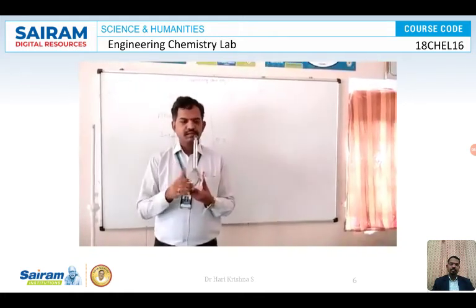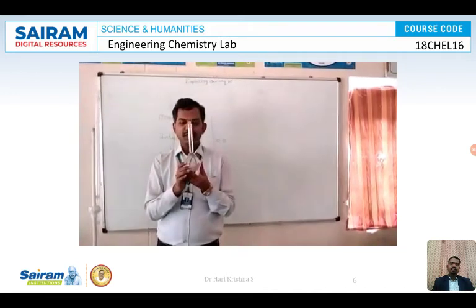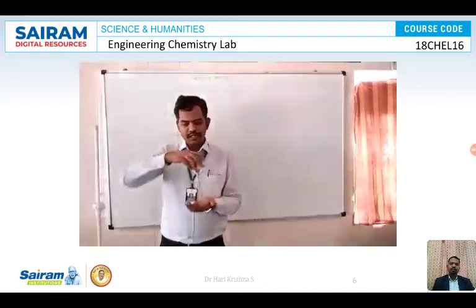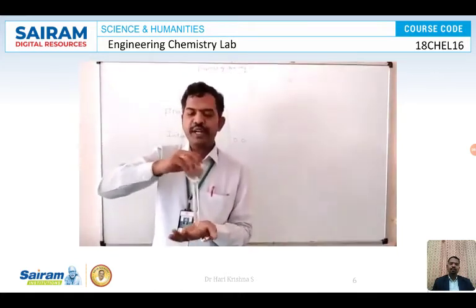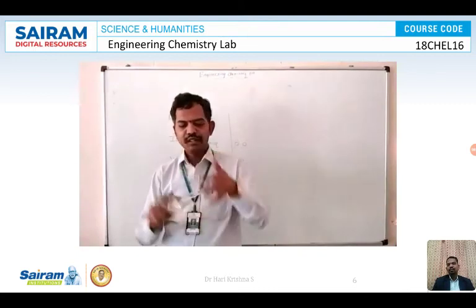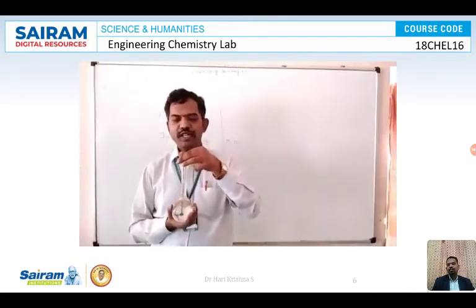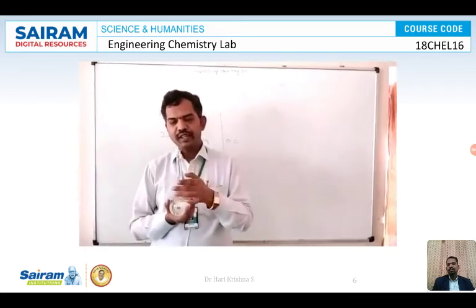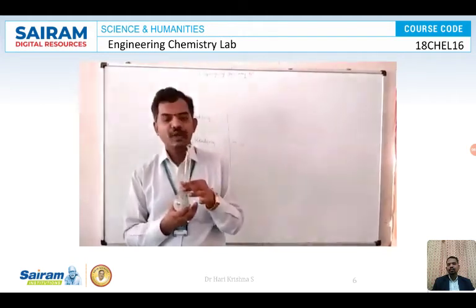Okay. So we are adding the water up to the mark over here. Once the water is added, we are going to shake it until we get uniform concentration. This is how we are going to shake it and release the pressure. Again we are going to shake it and release the pressure. While shaking, it may leak. Even after leaking, if the solution level has come down, we are not going to add any extra water.